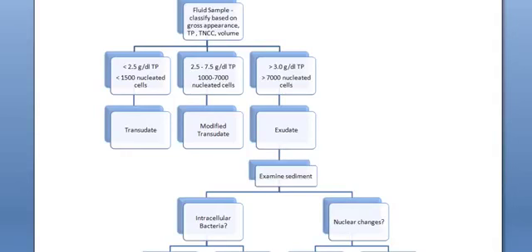When I performed an estimated TNCC on Rosemary, there's only about 3 neutrophils, so 3 times 40x squared is about 4,800. So if I use this estimated count of cells and her total protein, this fluid is going to be in a modified transudate category.